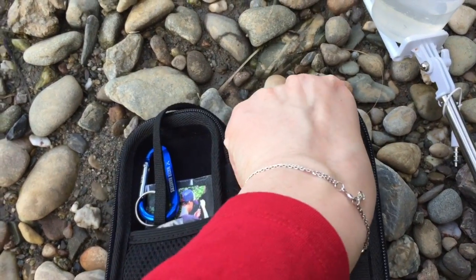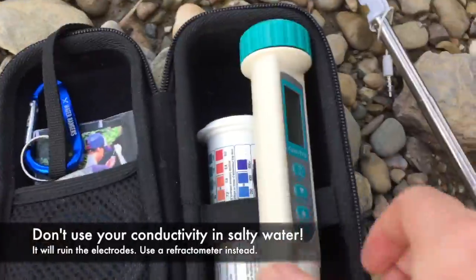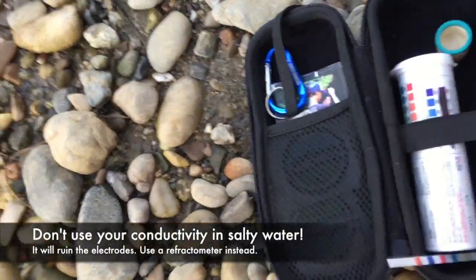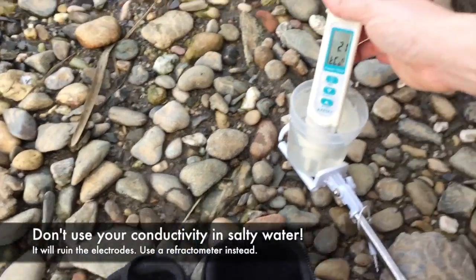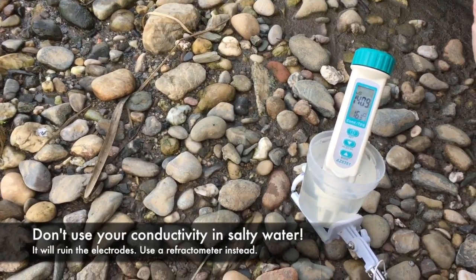I'm going to take my conductivity meter. Conductivity is for fresh water, and the refractometer is for salt water, so don't use this conductivity meter in salt water. That's high.